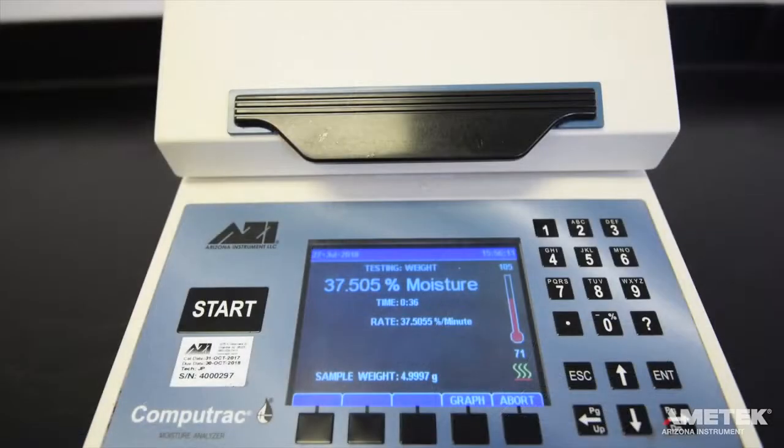The three gram weight that was removed represents 37.5% of the initial eight grams that the test started with. You'll notice the percent moisture value displayed on the screen is nearly that value, as is the percent rate of loss per minute. You will also note that the sample weight now reflects approximately five grams. The test will usually conclude in about a minute to a minute and a half.